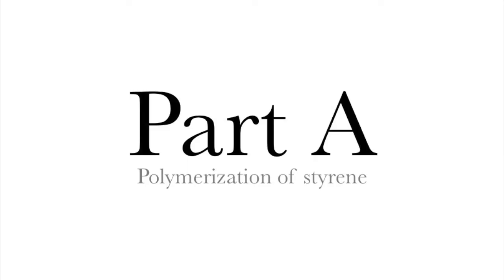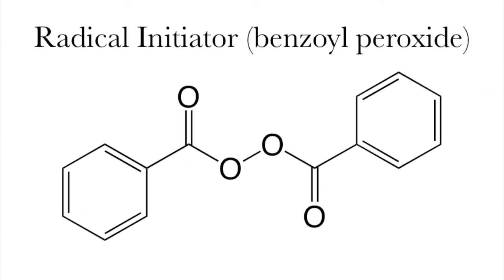Our first part today will be the synthesis of polystyrene. This is the type of polymer we often use for our single-use coffee cups, which goes through a radical mechanism. In order to get that radical, however, we need some kind of radical initiator. In this case, benzoyl peroxide.